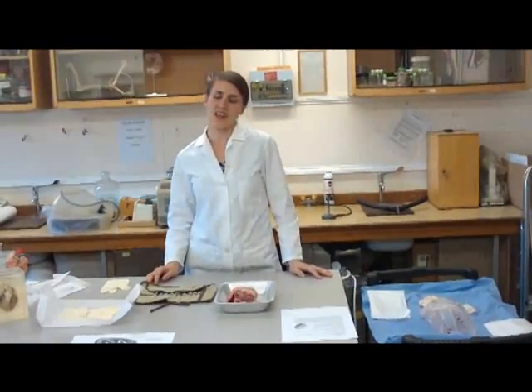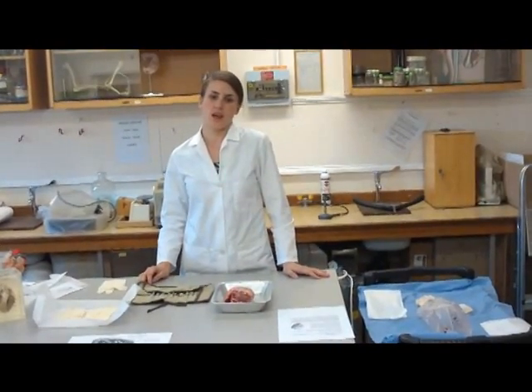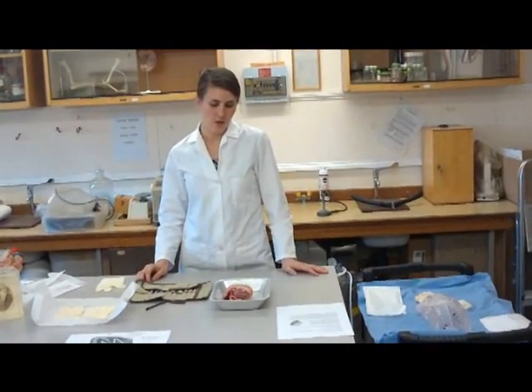The reason why we do a heart dissection is basically to identify all the parts of the heart so that we can actually see how it's structured and then relate that to how it actually works.